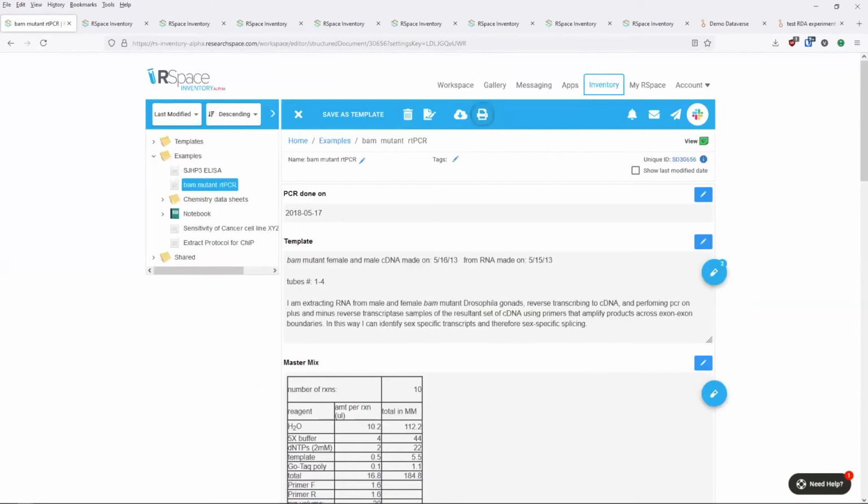Now, something else you might want to do is, as we were mentioning repositories, you're finished with your experiment, you're quite happy with how everything went, and you want to share your research with the world, and you might want to export to Dataverse or maybe Figshare. So I'll quickly demo that.